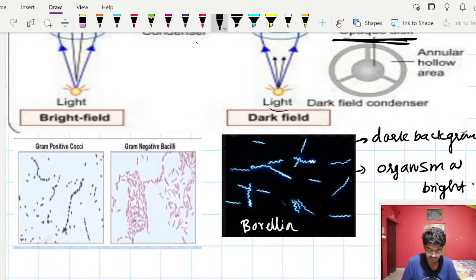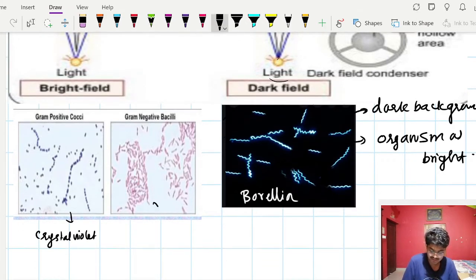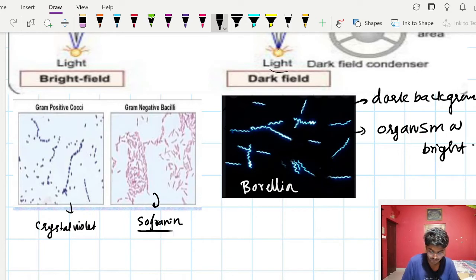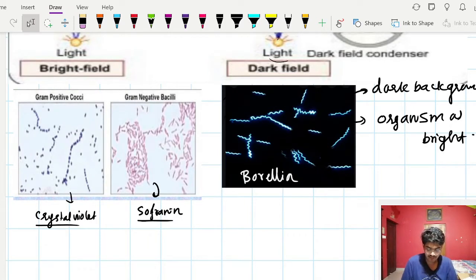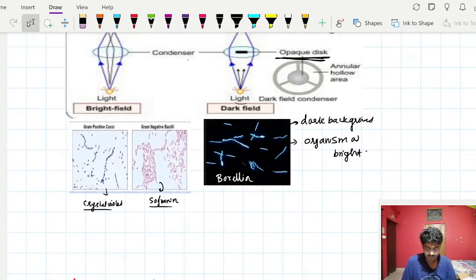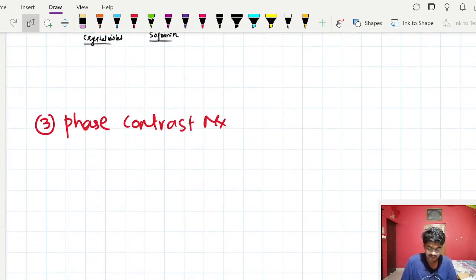In bright field microscopy using gram staining, gram positive cocci appear violet using crystal violet as the primary stain, while gram negative bacilli get stained with safranin as the secondary stain. So this is how bright field looks like and how dark field looks like.